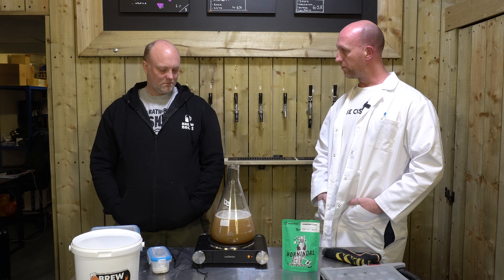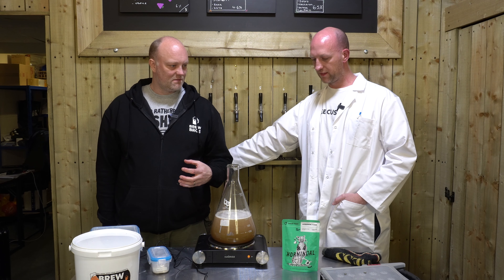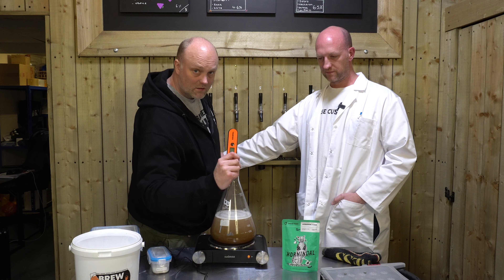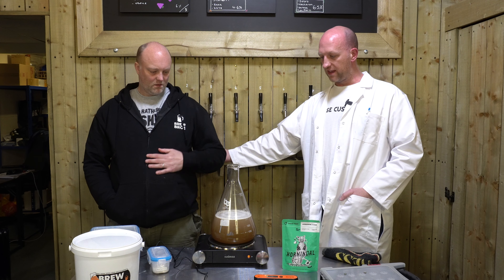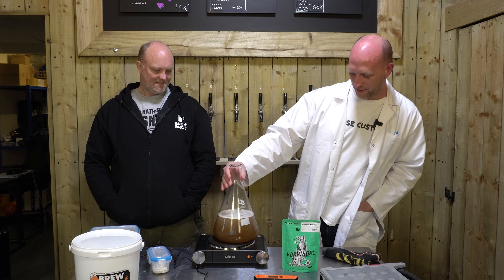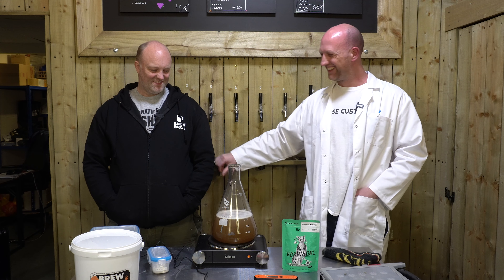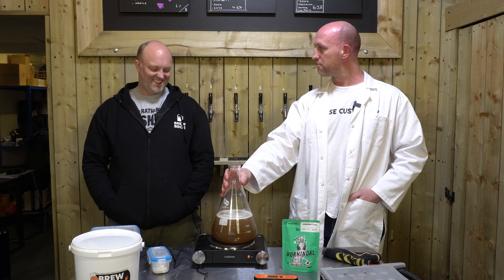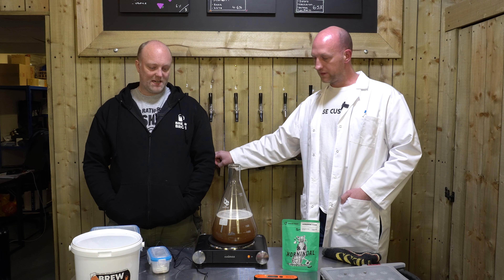We're just waiting for this to get up to a boil, then we're going to let it boil for 10 to 15 minutes. A handheld thermometer will be needed for when we cool it down. These Erlenmeyer flasks are great — they're borosilicate glass, which means you can go from boiling temperature straight into freezing cold water and it won't crack the glass. Really handy. Let's get it up to a boil and continue from there.